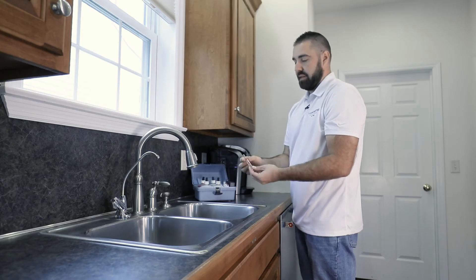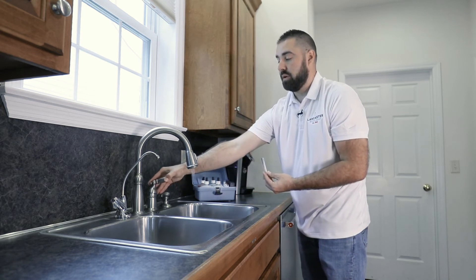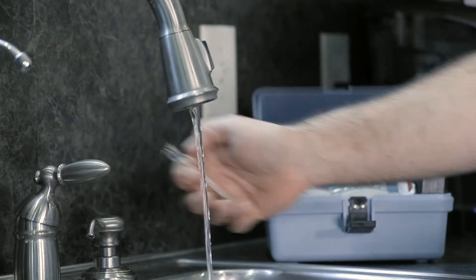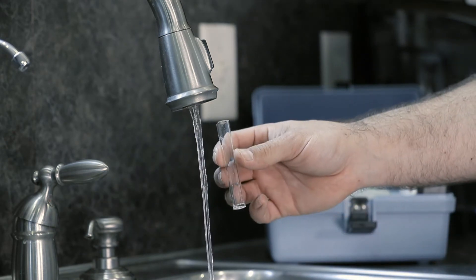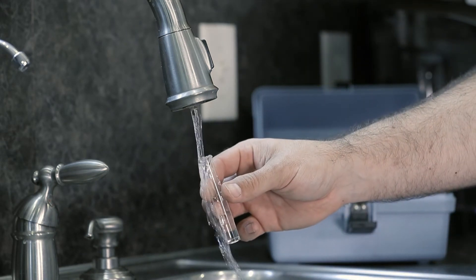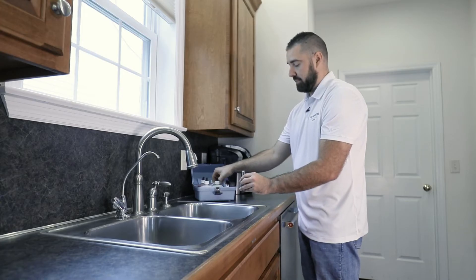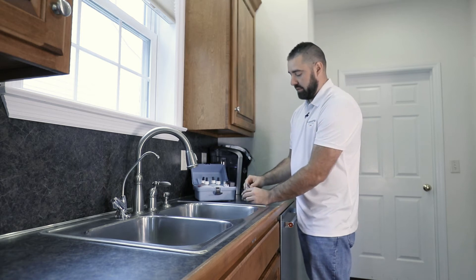In the kit is a small plastic vial. We will run the cold water. Once the water has run for a couple of minutes, please fill the small vial. Once that vial is full, we will then take it and dump it into the glass vial.